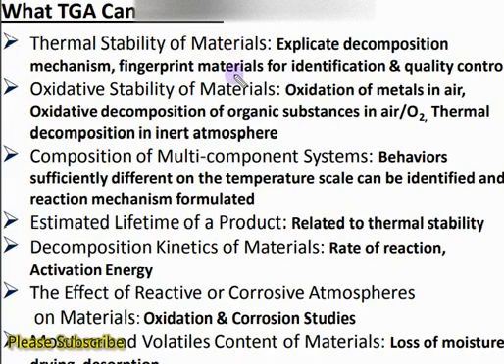The TGA curve is the fingerprint for a particular material, so that we can identify at what temperature, or in what range of temperature, the material is stable.